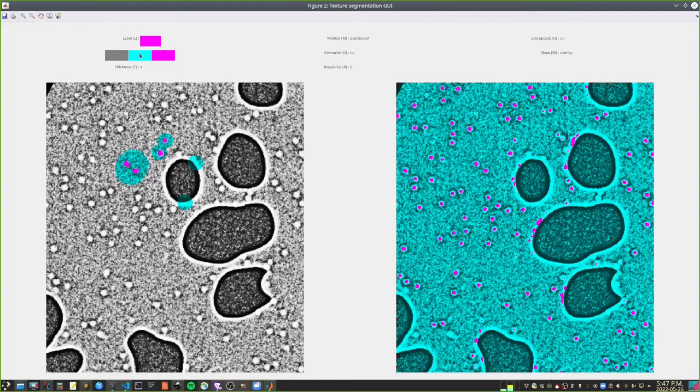Okay, so at this stage, it's pretty decent. We could probably go with this, but I think we can improve it. So I'm going to tell it that this region here is not fibers. Now we can start just looking at the result and correcting it locally. So you see there's a little fiber here. It can be a little bit bigger. See the ones that are only partially found.